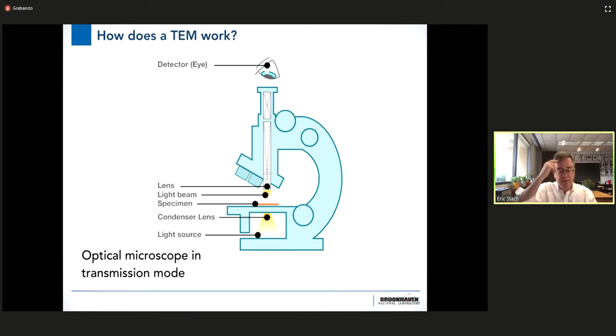So if you think about the use of the optical microscope, when you change from one click, click, click, you're changing from, say, 5 times, 10 times, 20 times magnification. That's the primary imaging lens, the objective lens. And then thereafter, you'll have 1 or 2 additional lenses that magnify that further until it reaches the detector, which in this case is your eye.